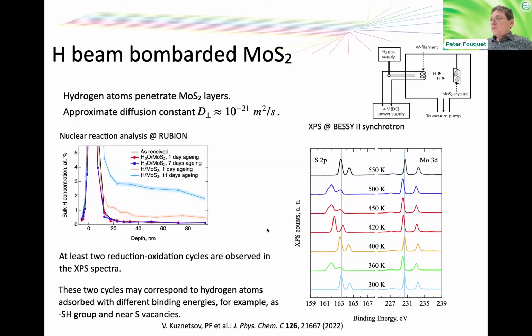after days. We also saw, when we looked at XPS, heating up the sample, that there is reactivity. There's not much happening on the molybdenum line, but the hydrogen seems to be strongly bound to the sulfur, and there's chemistry happening there.